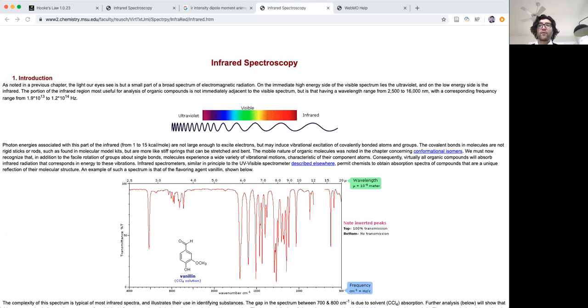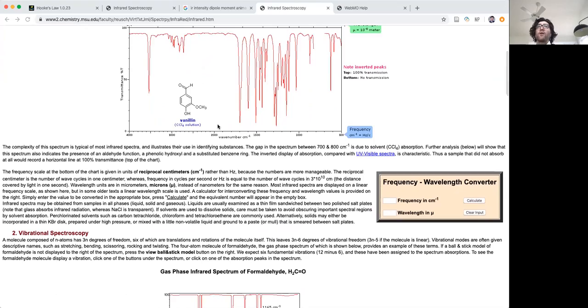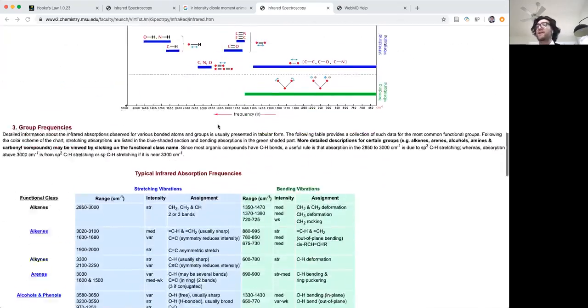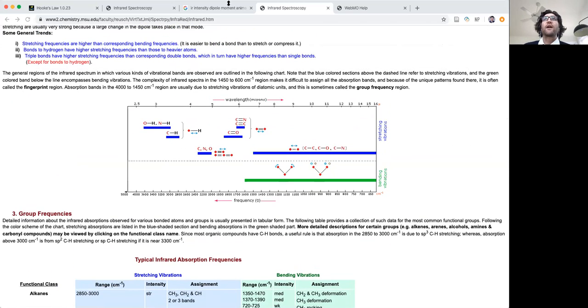This is section 14.6. And today, instead of thinking about our written notes as we have before, we're going to talk about IR spectroscopy and analyzing an IR spectrum. We're going to use this nice resource from the Michigan State University website. That is the chemistry department's website. I'll post this later in class resources.